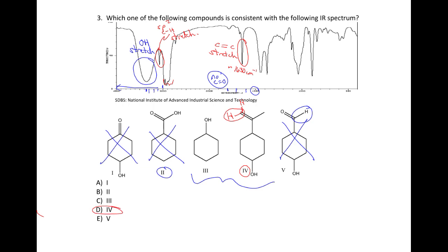So we did it, again, partially by process of elimination and also by examining the functional groups present in the molecule. So clearly we have both an alkene and an alcohol, and they're present in our infrared spectrum.